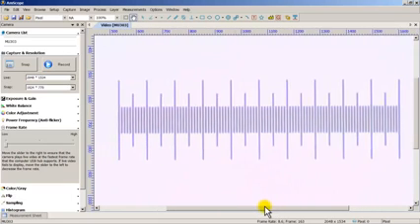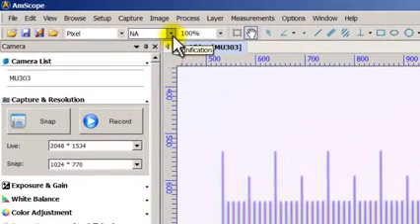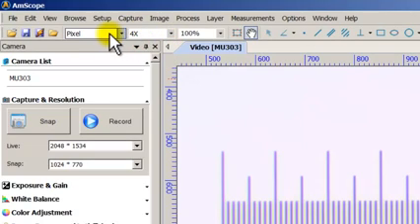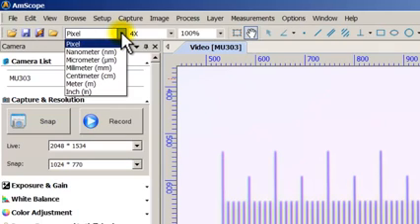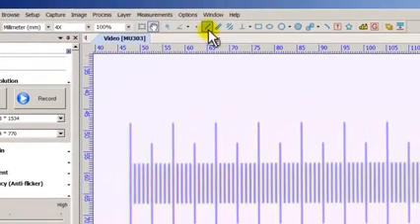All right, so I'm here again. Now, as always, I do have the 4x objective set. I haven't changed it yet. So I'm going to go ahead and click 4x. And where it says pixels, I want to measure this in millimeters, just to check for accuracy, okay? So here it is, millimeters. And what I'm going to do right here is on the very top, you could choose your lines. I want to make a parallel line, or an ellipse, or a square, or something like rectangle, whatever. But right now I'm going to go ahead and do a straight line.